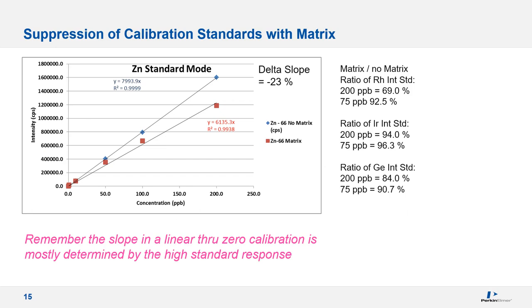Let's look at the calibration plot for zinc in standard mode. Blue points are calibration up to 200 ppb with no matrix, just the analytes of interest. Red dots are the calibration when calcium, sodium, magnesium, potassium, and silicon are added at increasing levels to the top three standards. When 25–50 ppm of calcium and sodium and 5–10 ppm of magnesium, potassium, and silicon are added, the slope of the zinc calibration is suppressed by 23%. In addition, different internal standards are suppressed by different amounts: 31% for rhodium, 6% for iridium, and 16% for germanium. Picking an internal standard can be critical in this case — it won't fix everything. A similar effect occurs in KED mode with helium cell gas, where the zinc calibration is suppressed by 16%, and scandium is actually enhanced by 5%.